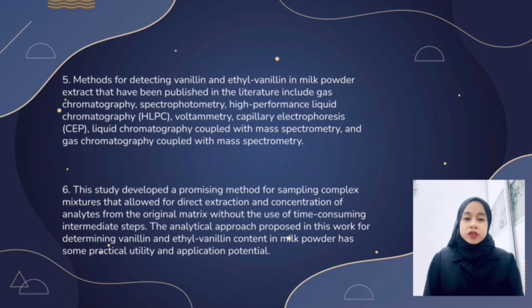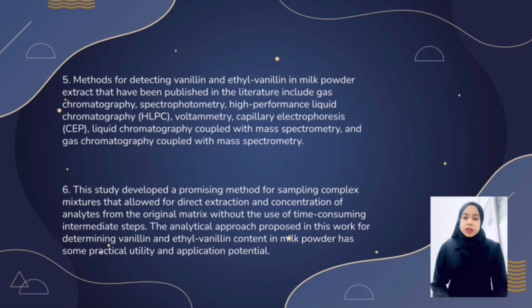Lastly, this research created a promising method for sampling complicated mixtures that allows for direct extraction and concentration of analytes from the original matrix without the need for a time-consuming intermediate process. The analytical method for determination of vanillin and ethyl vanillin content in milk powder developed in this study has practical value and application potential.